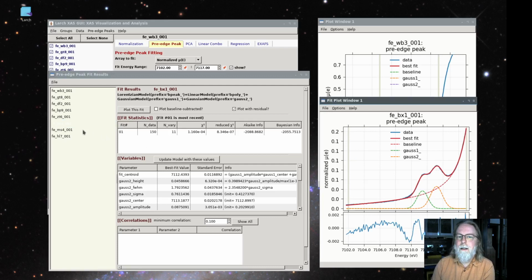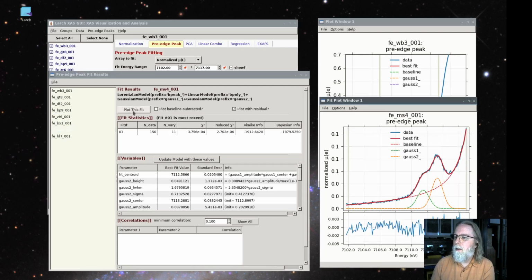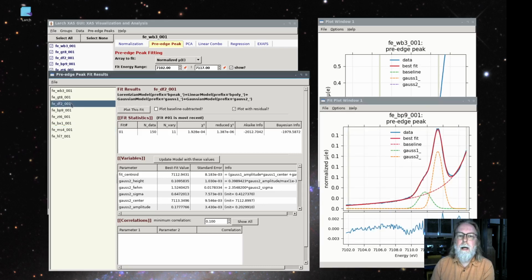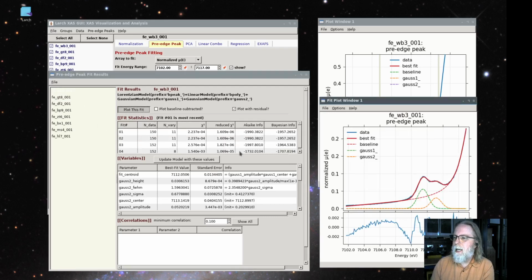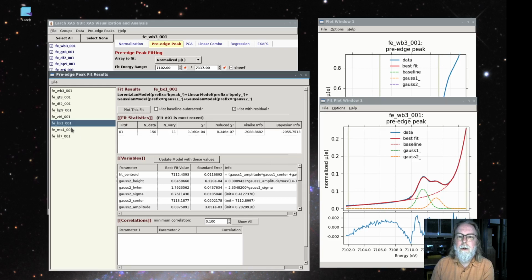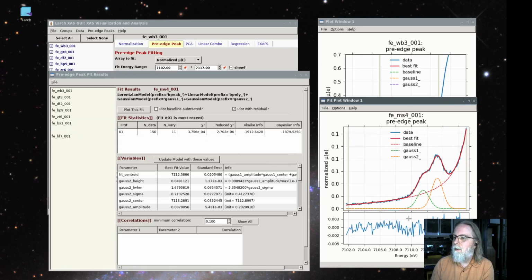The peaks are clearly moved around in opposite directions, and so on. And we can just inspect that all of these fits are okay. There is some noticeable residual, at least in the ones that have the cleanest data. There are some that are consistent with the noise level, but the data is noisier.